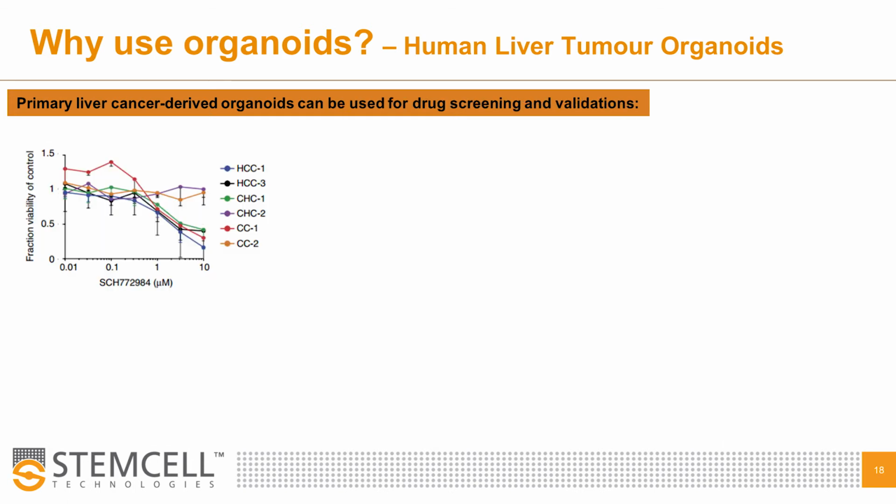To take the study even one step further, the authors carried out proof of concept drug sensitivity testing in 6 primary liver tumoroid lines. The goal was to evaluate their capacity to identify patient-specific drug sensitivities and to assess the utility of these tumoroids as a platform to inform drug development and drug administration. The authors tested the organoids' sensitivity to 29 anti-cancer compounds, including drugs in clinical use or in development.